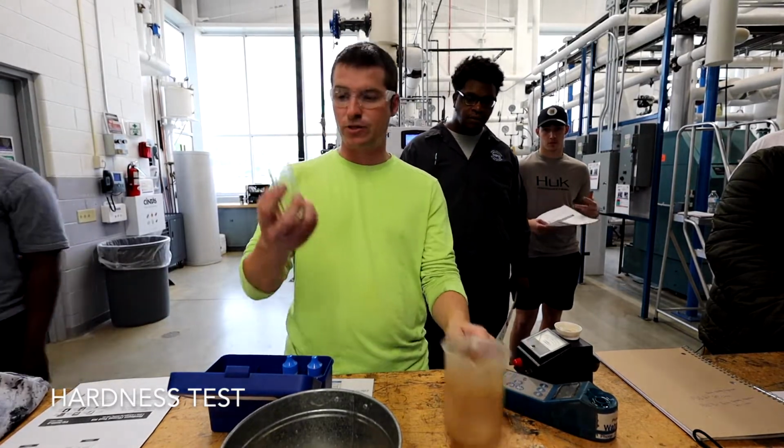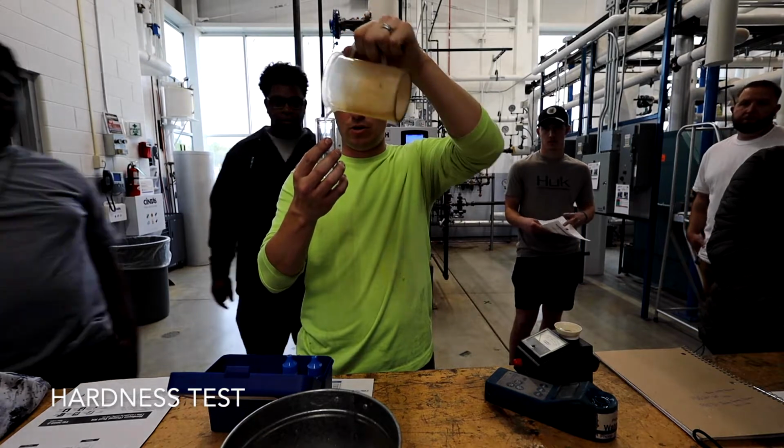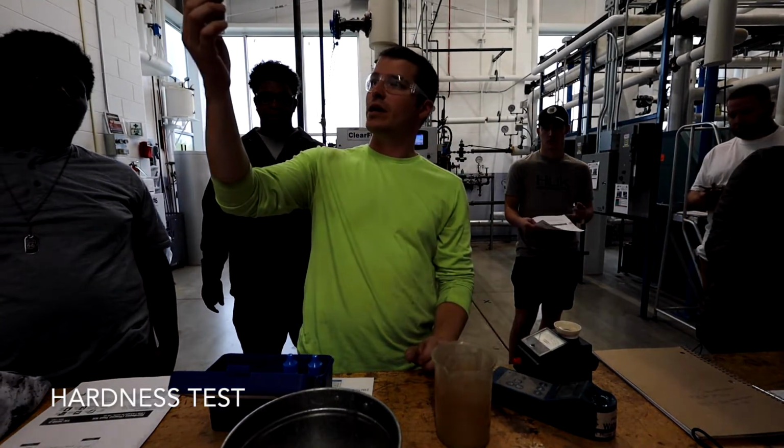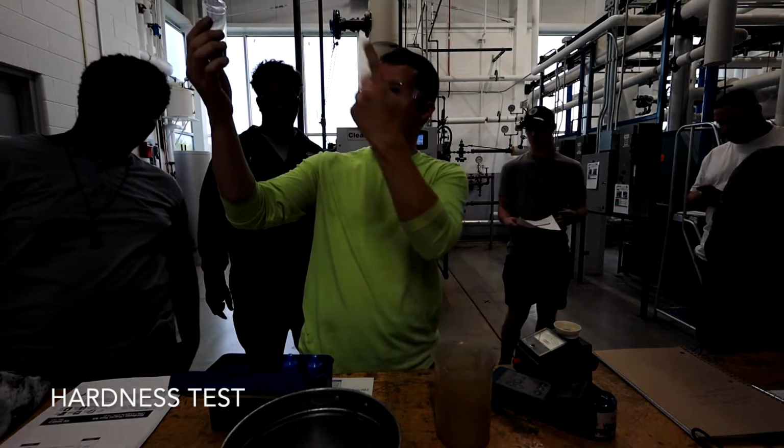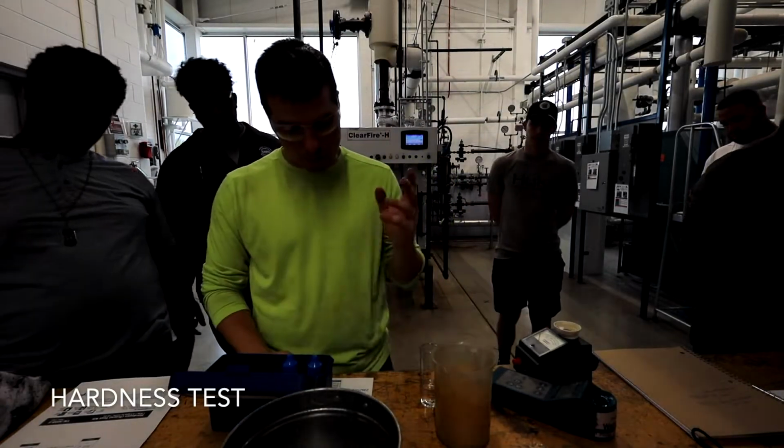So we're going to fill this up to the 25 milliliter mark. I'll probably have to go get more water at some point. Okay, so you want to look and see, so I poured it right to the 25 mil mark. Look at that. So we'll go to step 2 then.